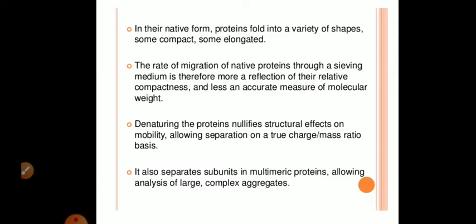Whenever a protein is treated with sodium dodecyl sulfate, SDS in short, being a strong anionic detergent, it will open the protein. It will make the protein into a thread. Even if it is entangled, it will convert the protein into a long thread, and swap all the charges that are present on the protein, and the protein will ultimately get a negative charge. So all in all, sodium dodecyl sulfate, a strong anionic detergent, destabilizes the protein, converts its compact structure into a thread-like structure, a long tube-like structure, and gives complete negative charge to the protein. It overshadows all the other charges.